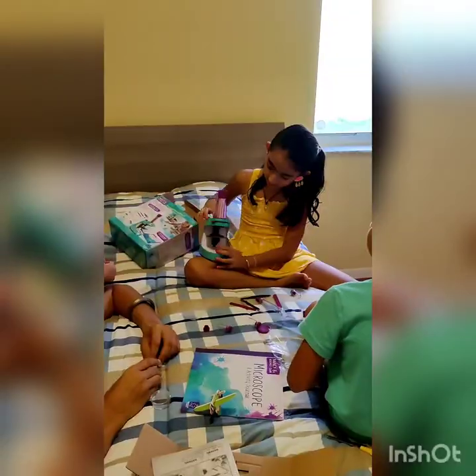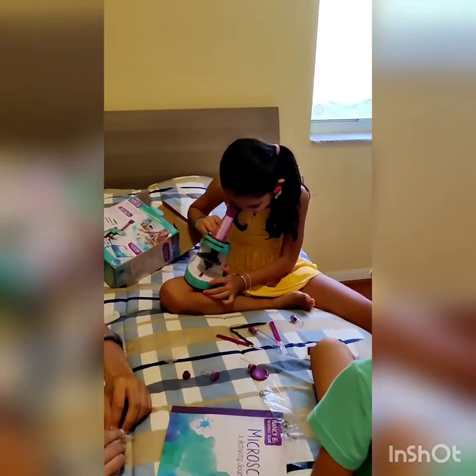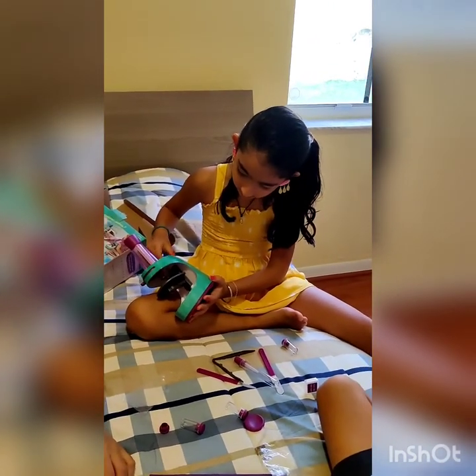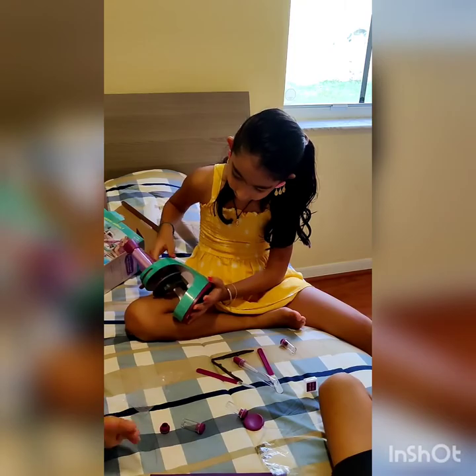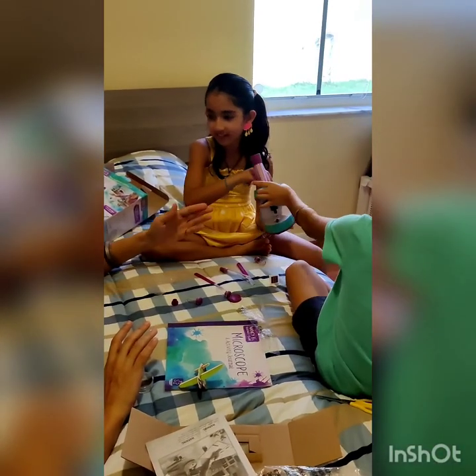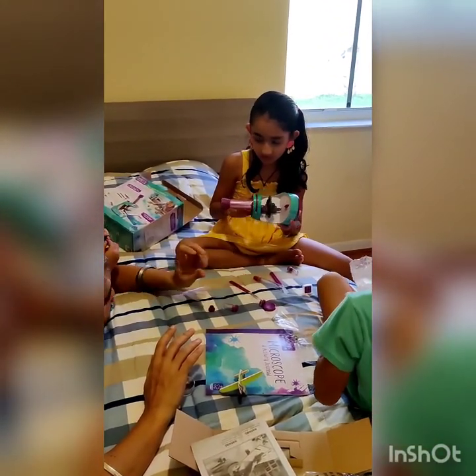Yeah, you can make it closer and lower, so that it becomes focused and you can see clearly. If it's too close, it'll look bad. Like when you bring the camera too close on the phone, it'll look very bad. Now you won't see anything if you do it this close. And if you keep it too far also, you won't see anything. You have to put it in the right place.